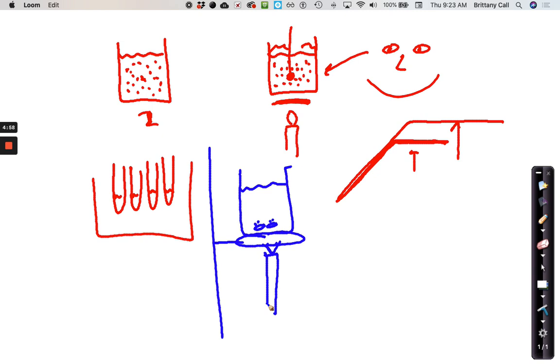Again, how can you tell when it's for sure boiling? When it plateaus, right? So as soon as it's constant for about 2 minutes, like it says, record the temperature when it is constant for 2 minutes. Okay? That's when we've got our boiling point.